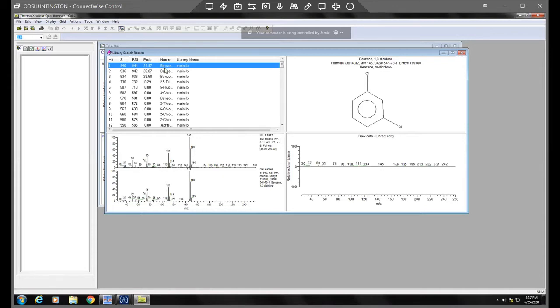And it's telling us that it believes that that is the number one choice and luckily it is one of our calibrated compounds. So I would agree.